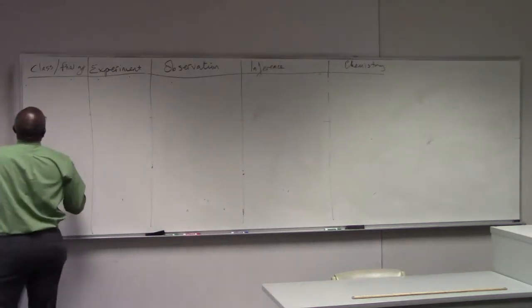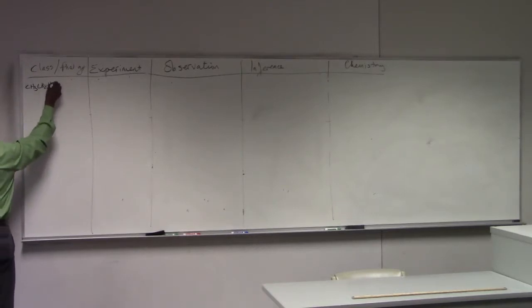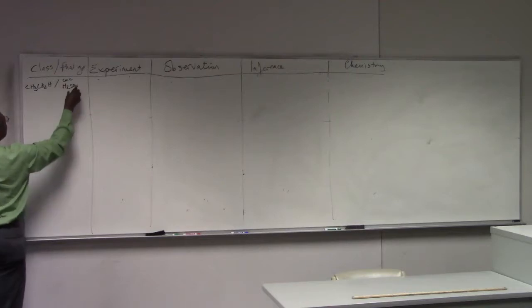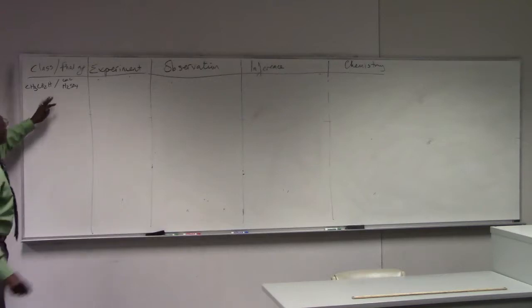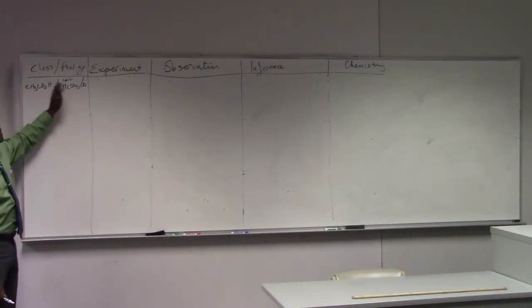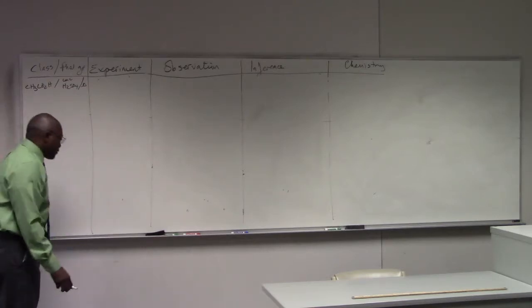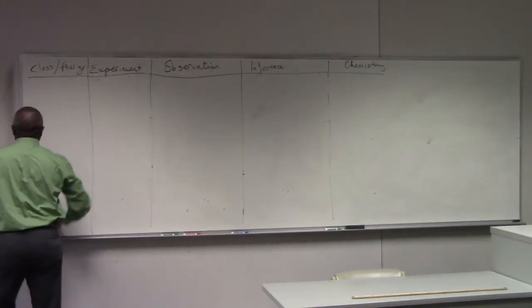Right. So what you use is CH3CO2H and a drop of conc sulfuric acid. So we use acetic acid or ethanoic acid and warm. We're still with alcohols.